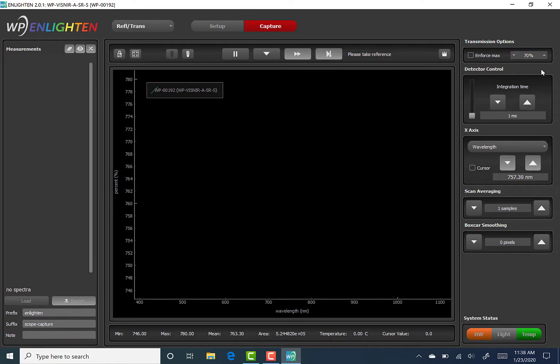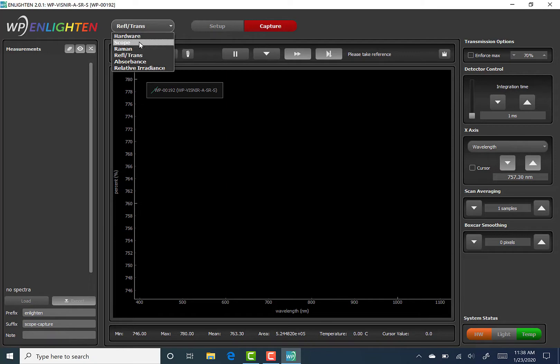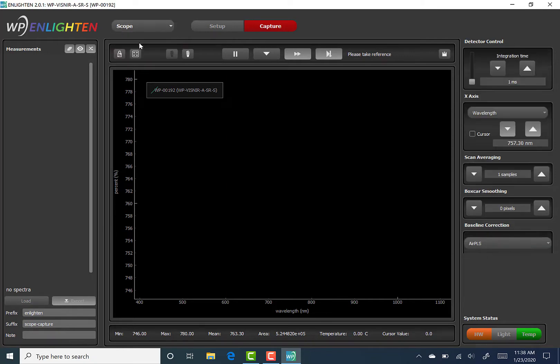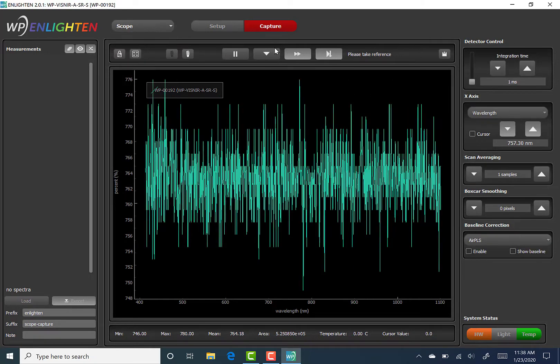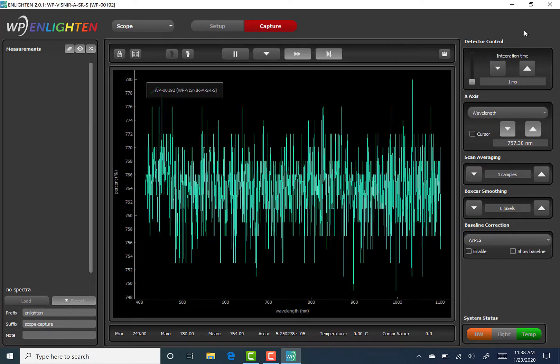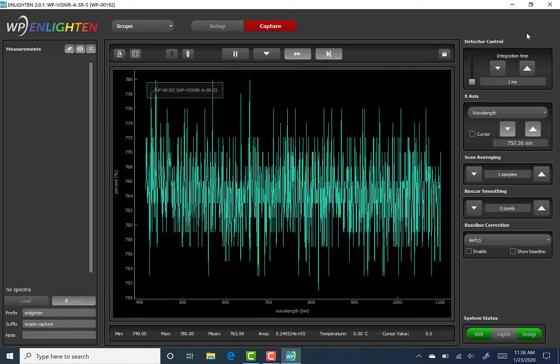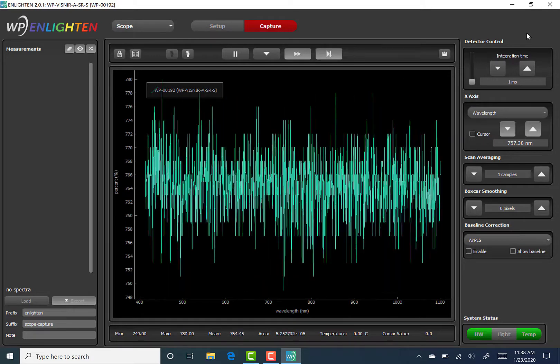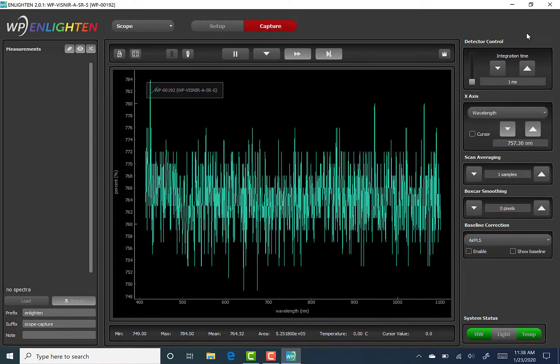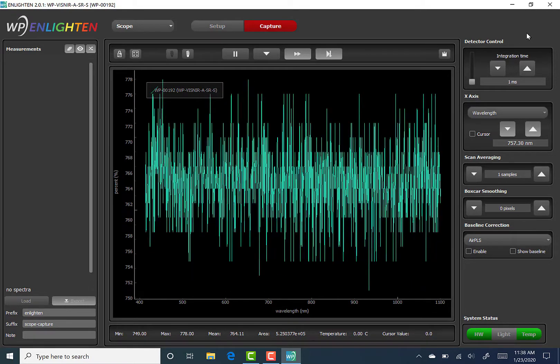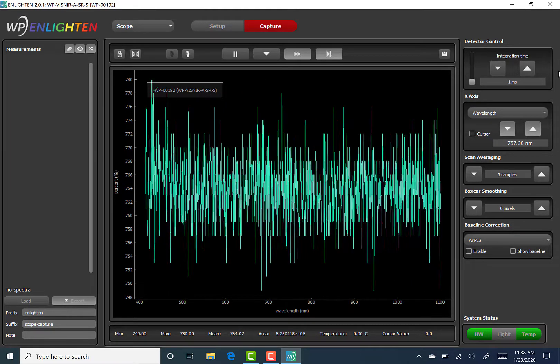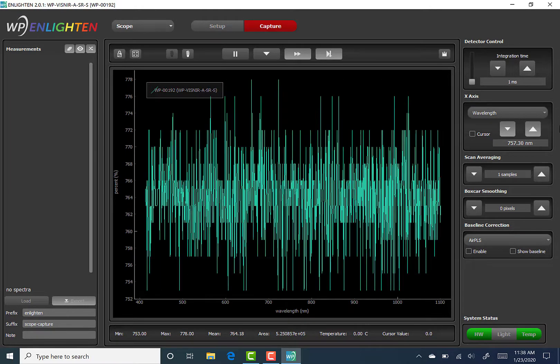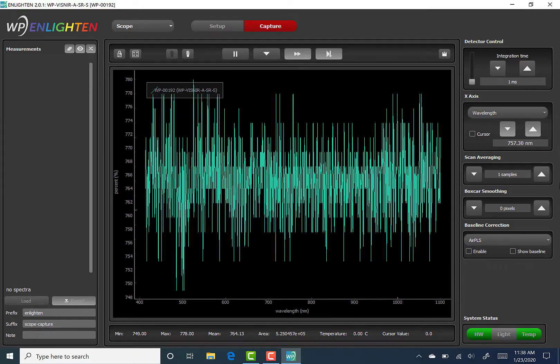Moving on to Light Source Control, which isn't currently pictured, this is an example of a function that is only available if the connected spectrometer itself has an embedded light source, typically an internal laser. Since I am using a visible near-infrared spectrometer that does not have an internal light source, let alone a laser, this function is not available in my current session of Enlighten.